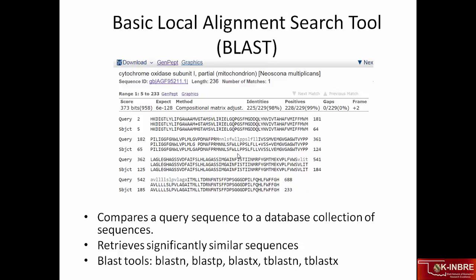So in this figure, I submitted a DNA fragment into BLASTX. BLASTX translated the sequence and then identified the protein sequence from its database that most closely resembled my sequence to help me identify the specimen.